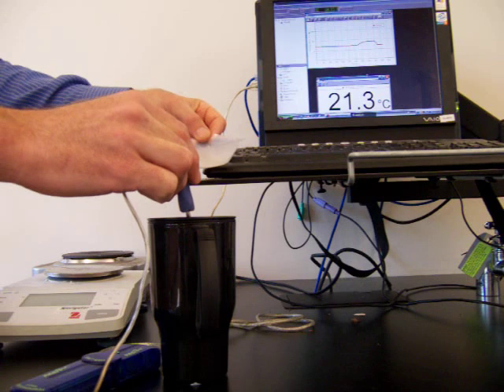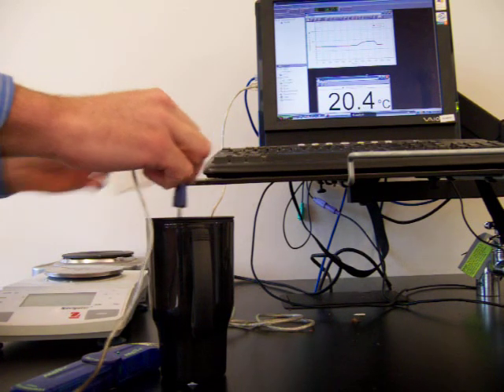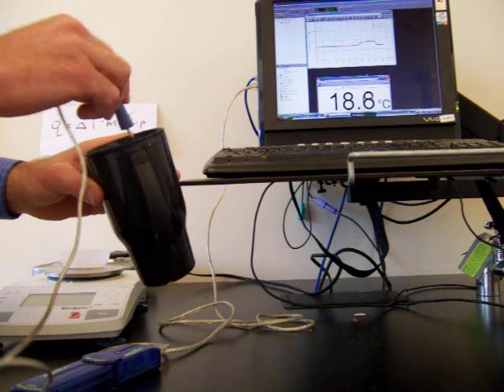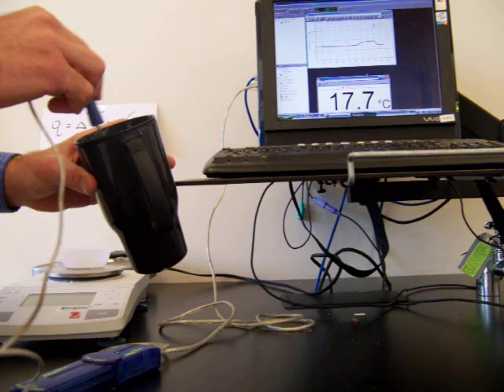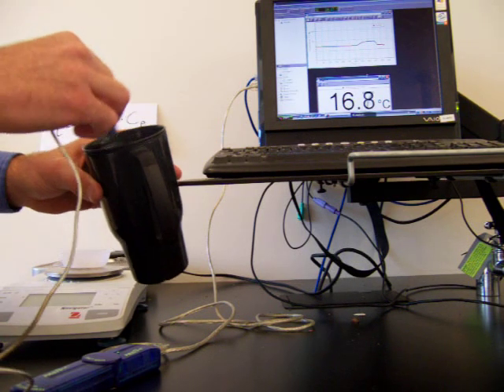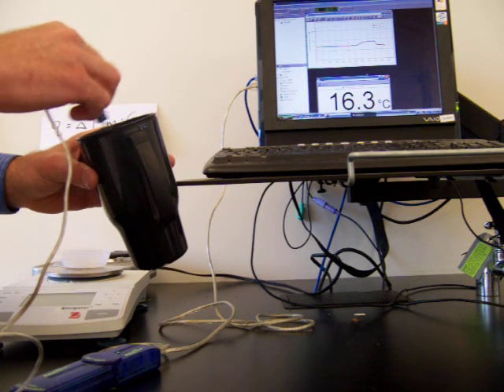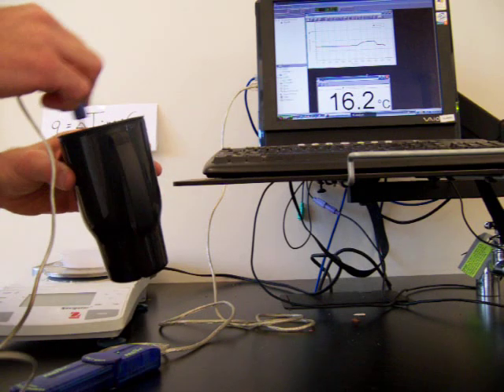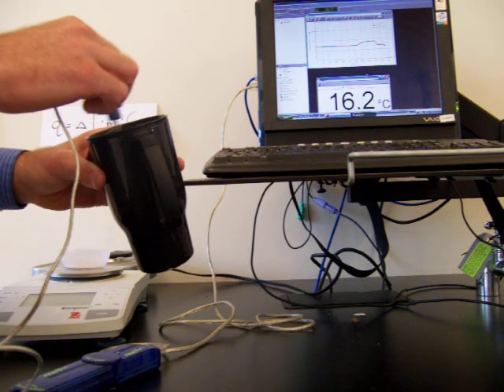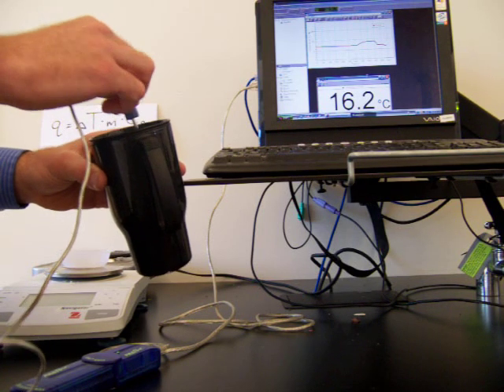Just like before, I'll take the potassium chloride and dissolve it in the water and stir. As this salt is dissolving, we can see the temperature of the water is changing — however, this time the temperature is decreasing. So this is an endothermic reaction. As the potassium chloride dissolves in water, it absorbs heat from the water, taking heat away from the water and therefore making it colder.